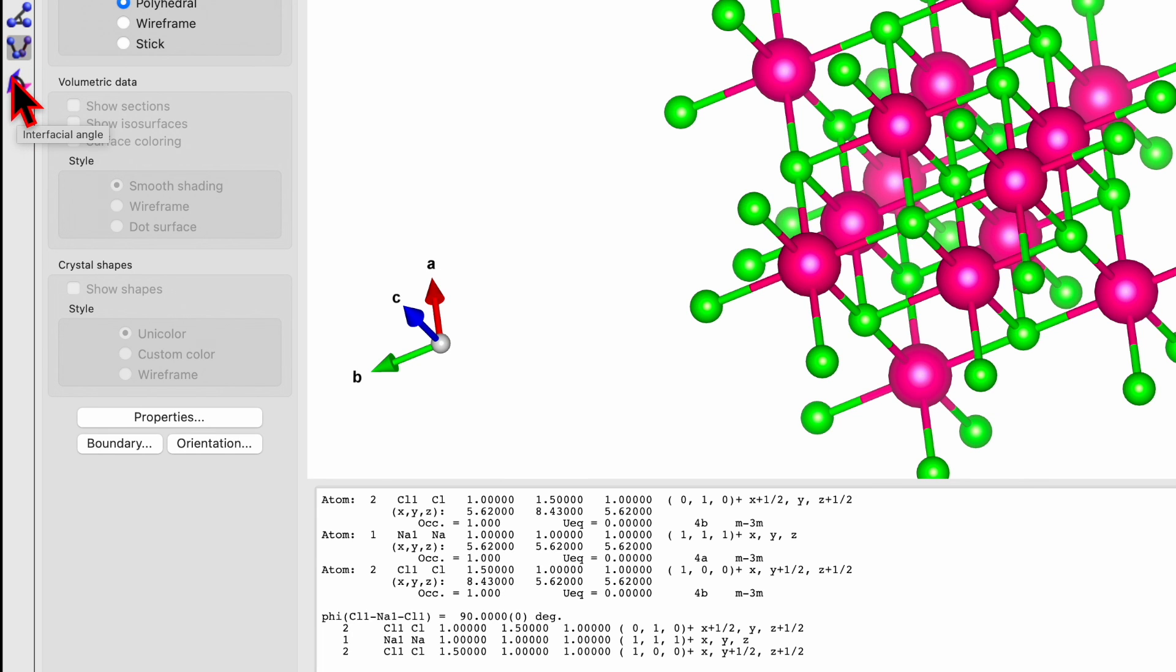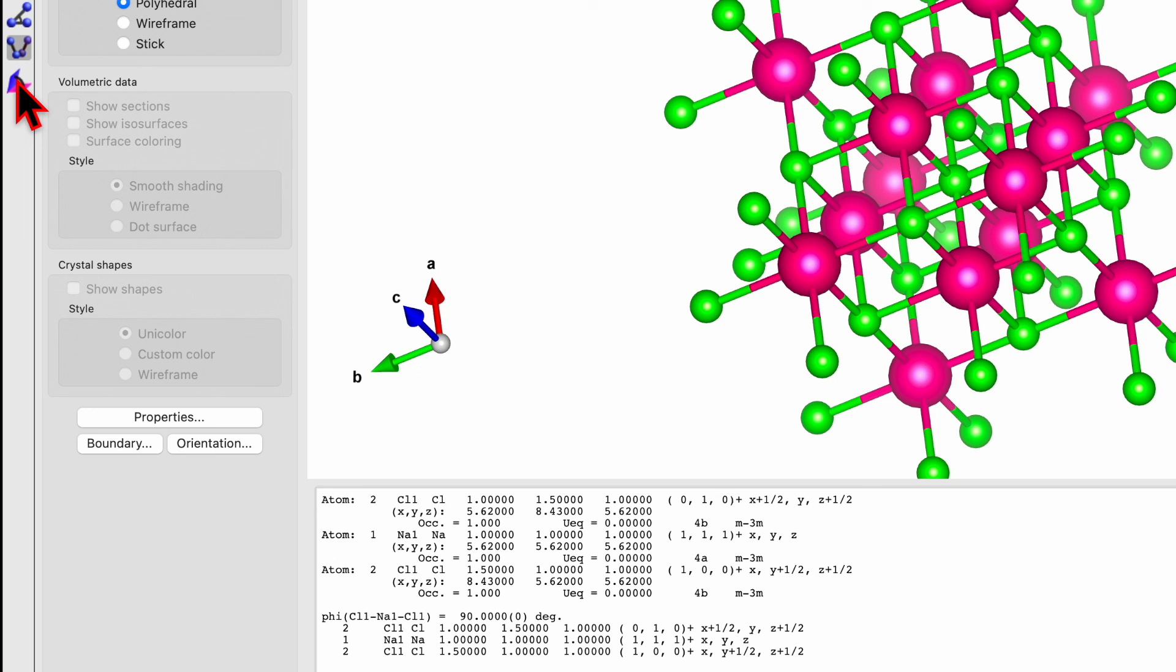And the last one is the interfacial angle. I know how to use this one but we cannot use it right now in this tutorial. So I will explain later in the coming tutorial how to use this interfacial tool.